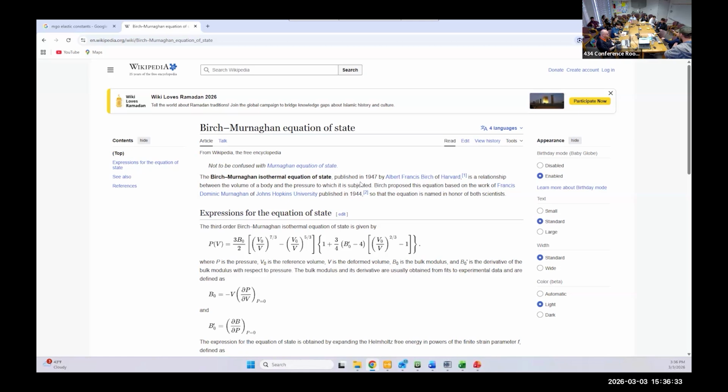So after you collect the data, when you go home, analyze the data more precisely. There are a lot of different software packages you can use to get precise pressure measurements.